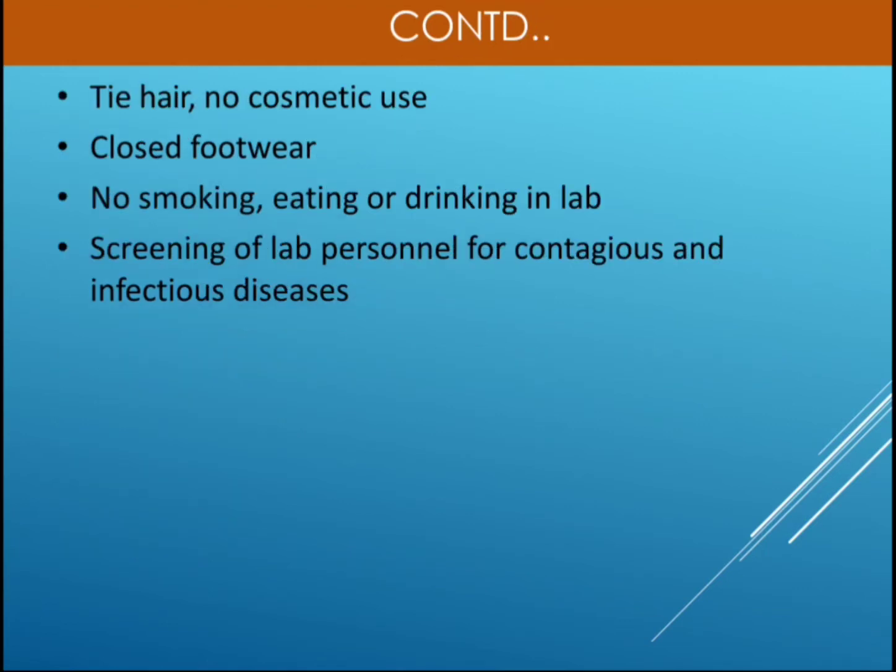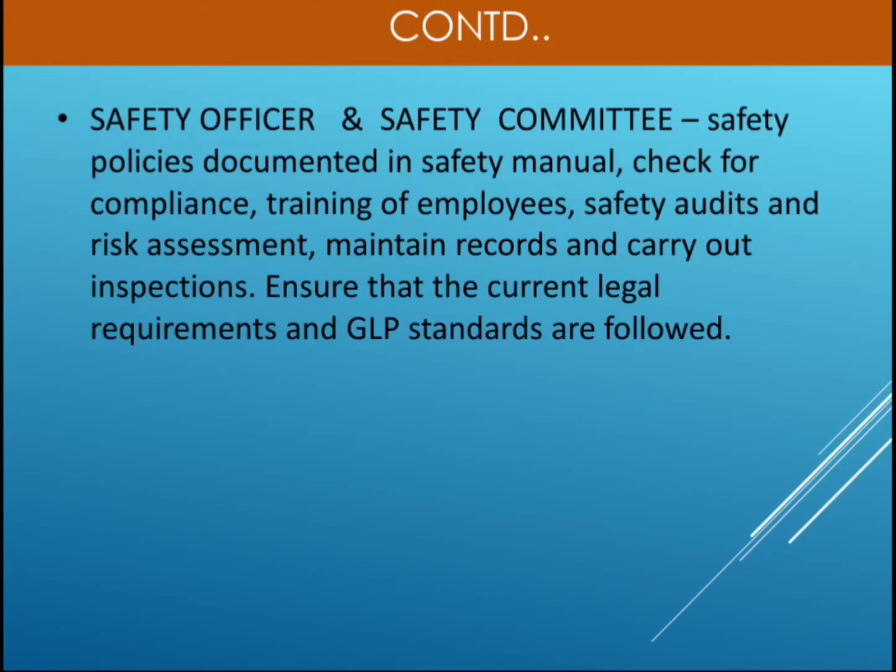So tie the hair, no cosmetic use should be there. The persons who are working in the laboratory should tie their hair. We should not use any cosmetics such as foundations and eyeliners and lipsticks and lip balms and all those things, because those can carry the dust particles. They can stick on the skin and then they may cause contamination. So no smoking, eating or drinking in the laboratory. Screening of lab personnel for contagious and infectious diseases should be there.